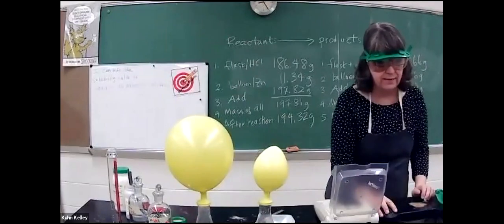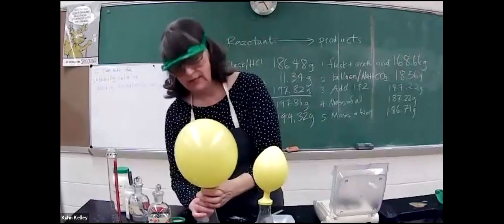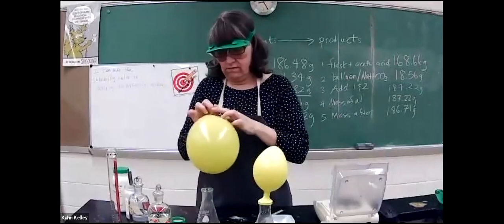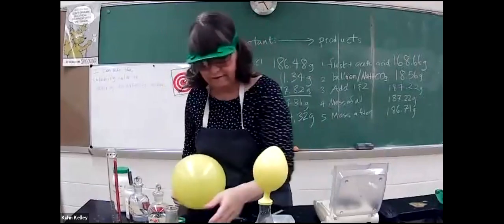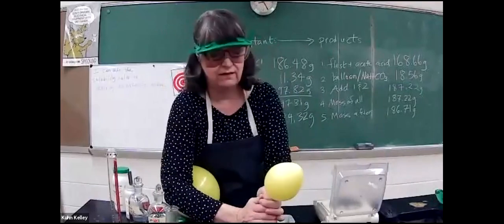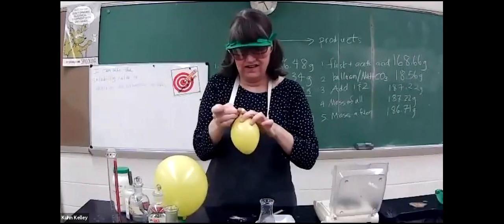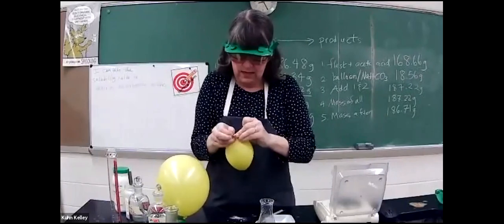I'm actually gonna clean up, but before I do, I want to show you one thing. I'm gonna tie these off. And I just wanna show you the comparative mass of these balloons. Obviously, this one didn't get inflated as much. But maybe that means it has less gas, which means the gas has less mass, right? The balloon part still weighs the same.